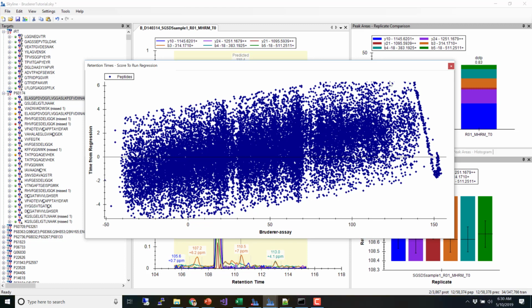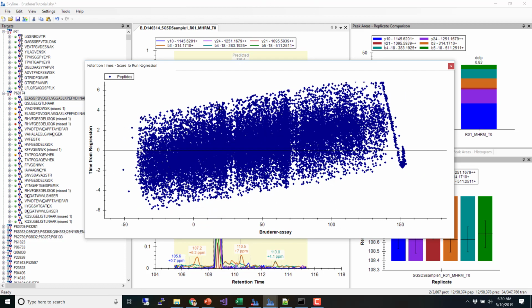I feel like it should be getting cut off at, yeah. So anyway, there are some things to work out, and I really don't understand what this thing is. But you can see that they're really quite different.